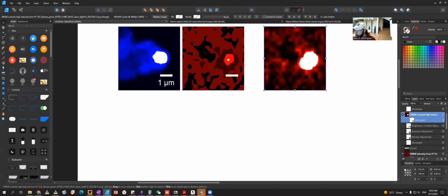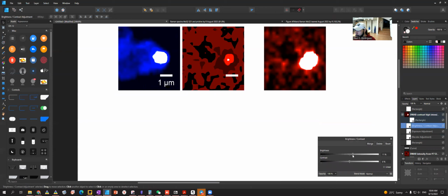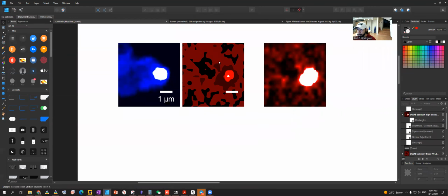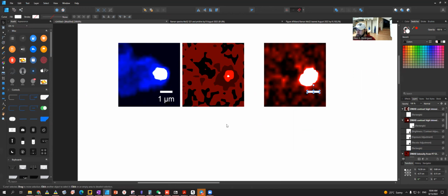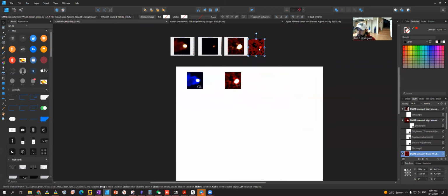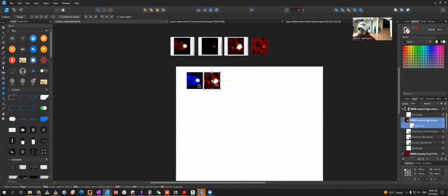So to make it more homogeneous, to make it more in harmony, images are better if they have the same style. So this one will be better than this one. All right, there is this curve, which, okay, it's that one. I can just move it here, arrange, move to front. And since I already did this one, I will not throw it away. I will just keep it here in case I need it.